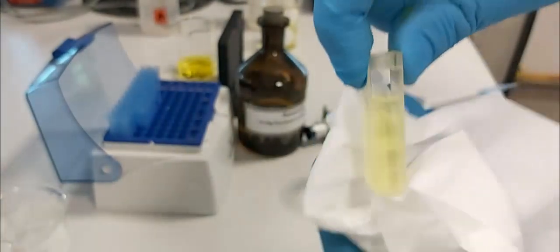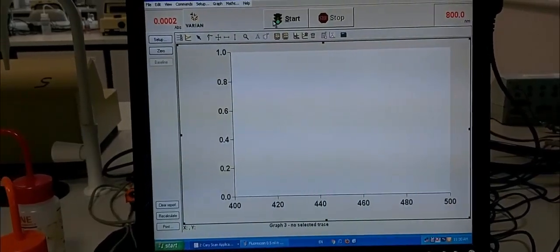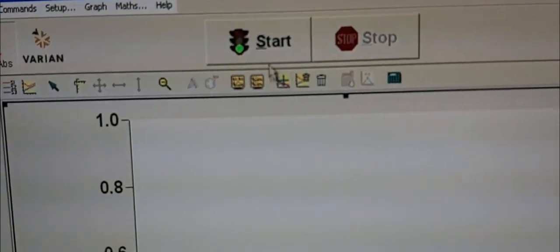As you can see, the cuvette has two clear faces. I will clean the clear face very well with a tissue in order to avoid any fingerprint or impurity that could affect the UV spectra. Then I will place the cuvette in the equipment in this direction — the clear face oriented east-west in the equipment. Then we go to the software and click 'Start' — very easy.